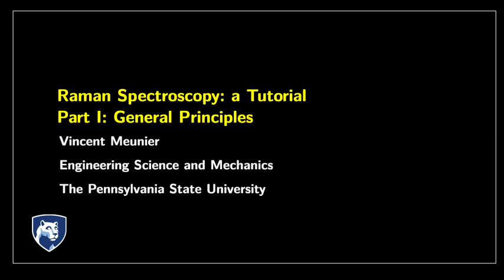Welcome. In this presentation, I'm going to talk to you about Raman spectroscopy and give you a basic tutorial of the technique itself. This is not about the experimental technique itself, it's more about the fundamental principles that govern Raman spectroscopy. So there are two parts in this presentation. The first part is going to be this recording, and I'm going to talk about general principles. And in part two, I'm going to talk about applications, and mostly in 2D material.